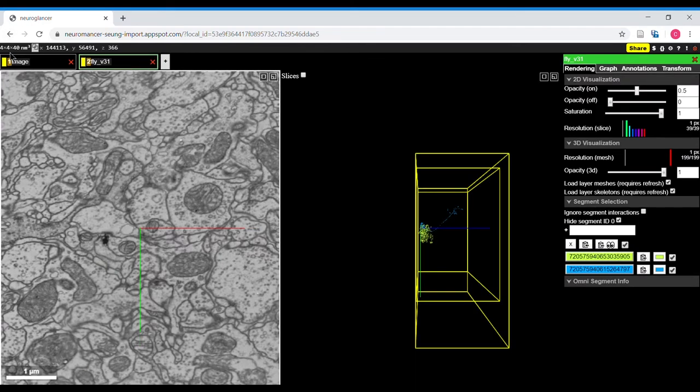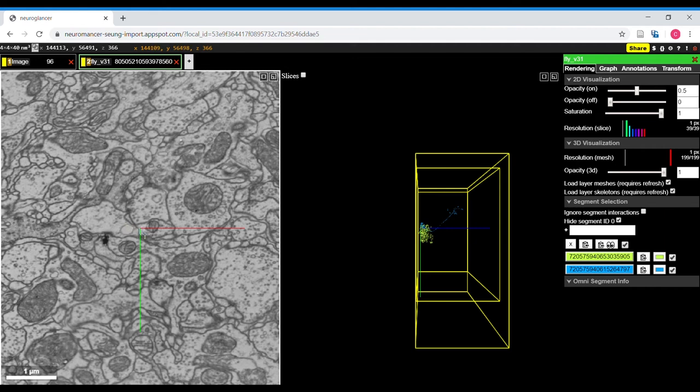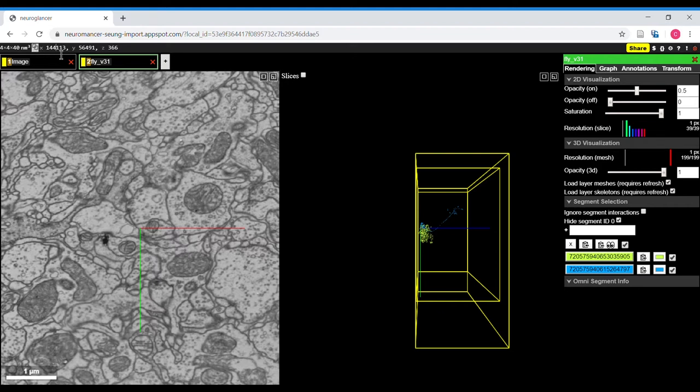This EM data set was collected at Janelia at a voxel resolution of 4x4x40 nanometers. That's shown up here. Next to it are the XYZ coordinates of where your crosshairs are located. These coordinates can be copied using this button and you can also manually edit them or paste into this field.